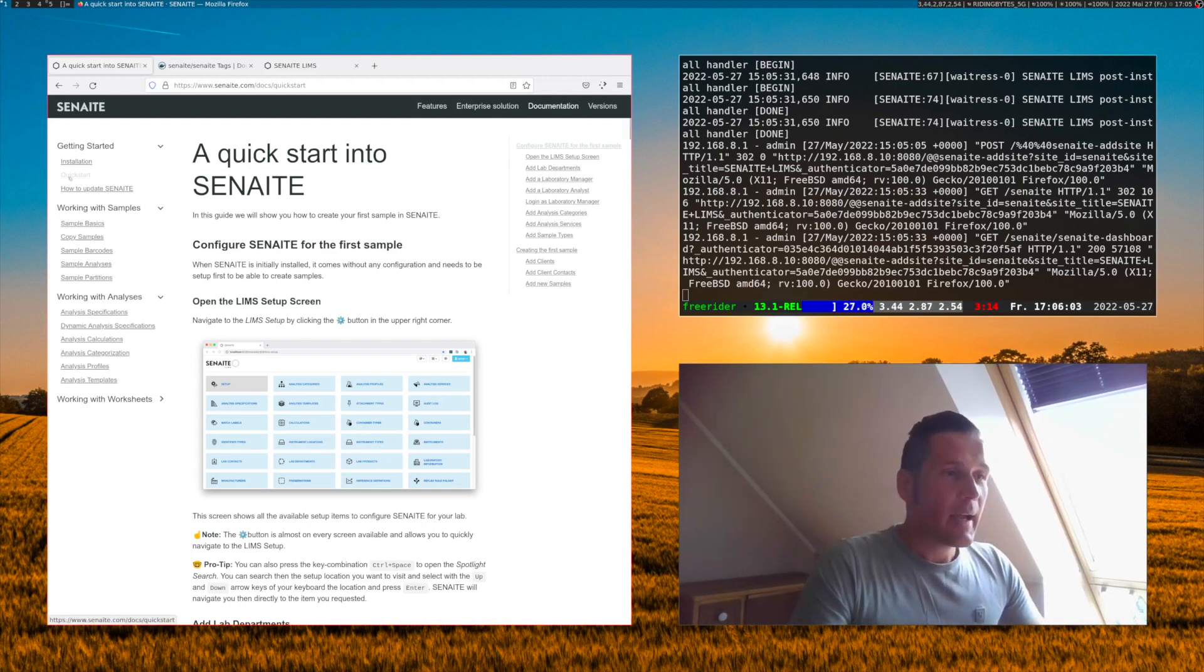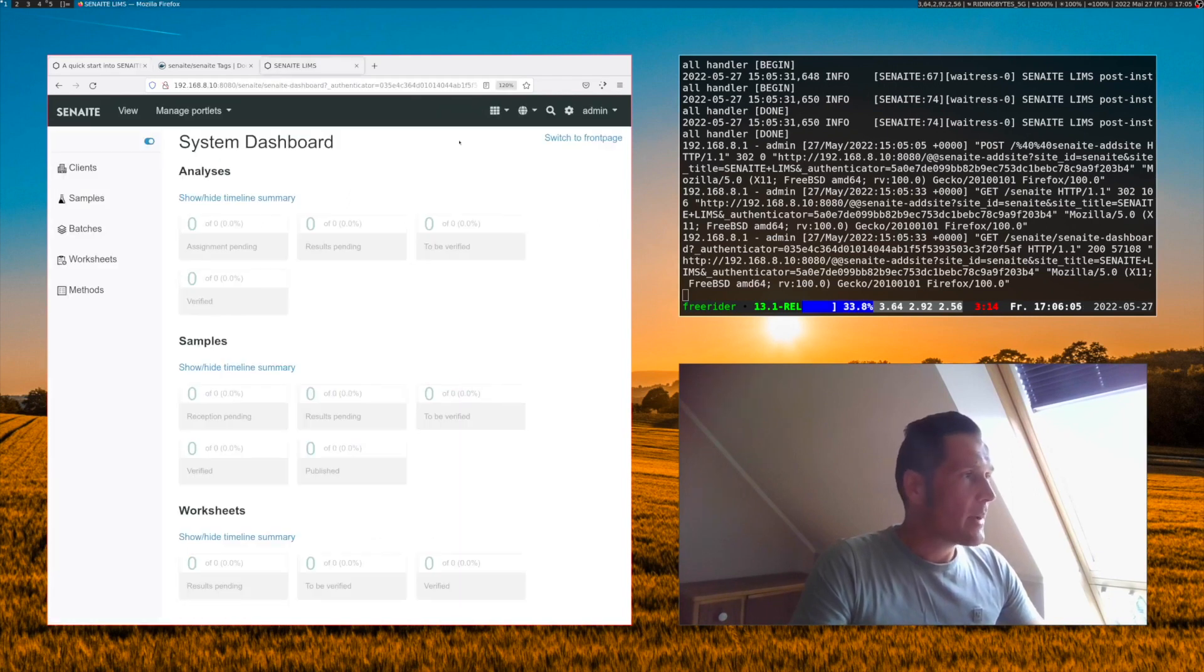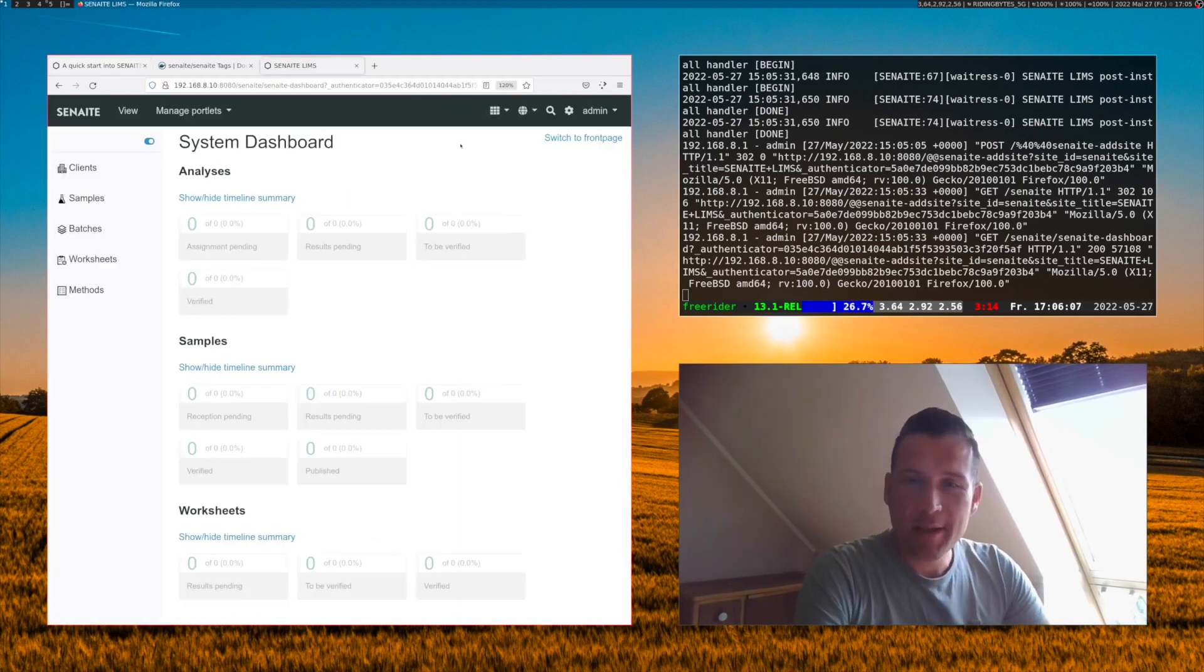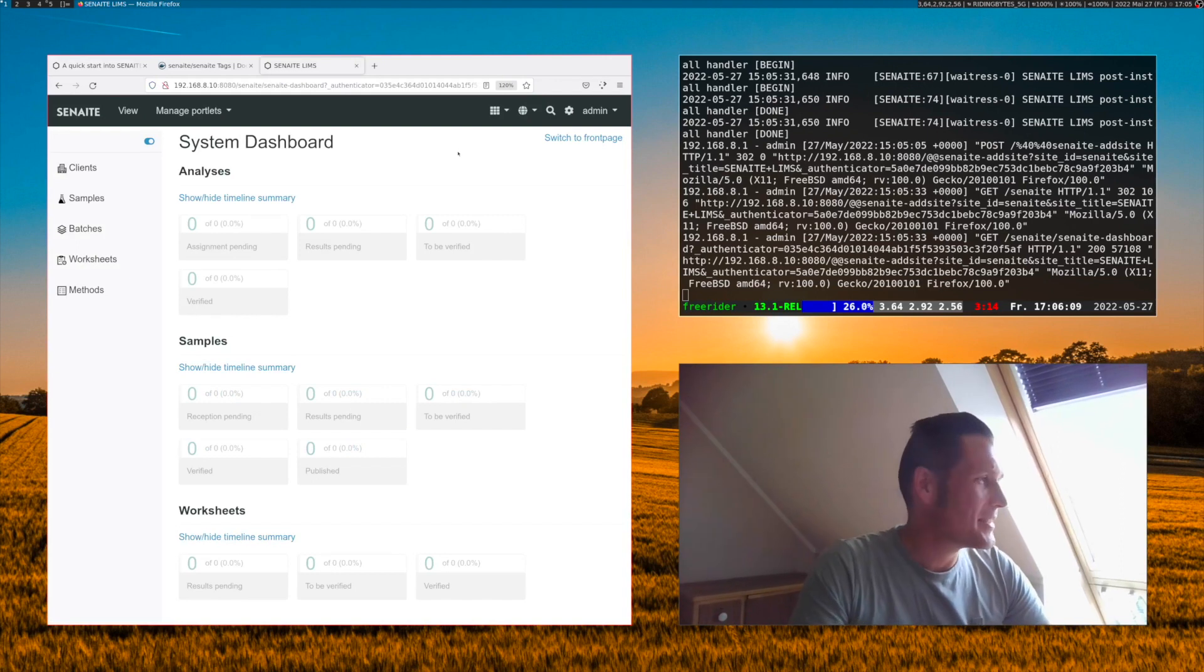All right, everything seems to be installed. Let's go back to our Senn8 site and here we see the start page of our Senn8 site.